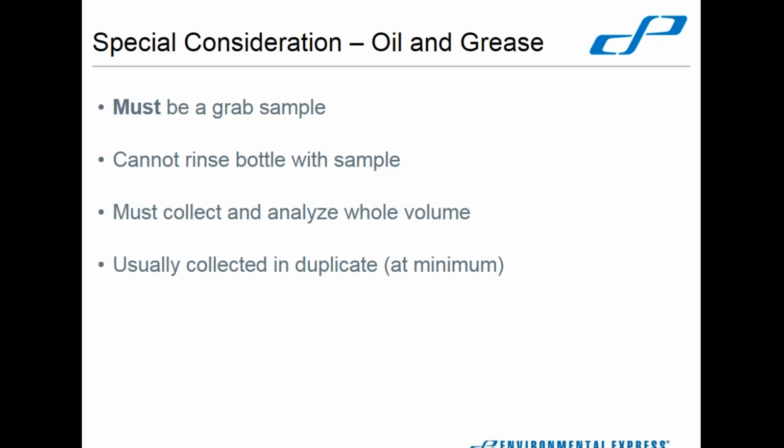If something happens at the lab, the QC fails. Occasionally, I've seen samples get spilled, dropped, whatever. There needs to be backup. There's also additional QC requirements.